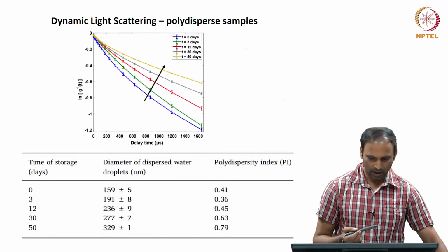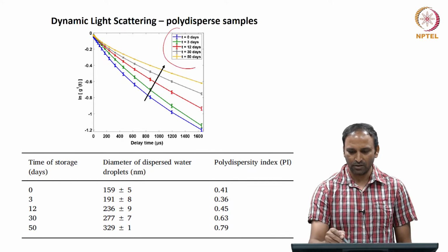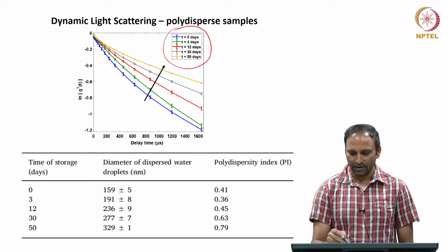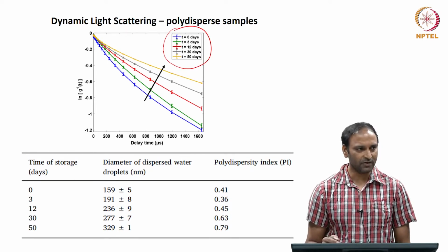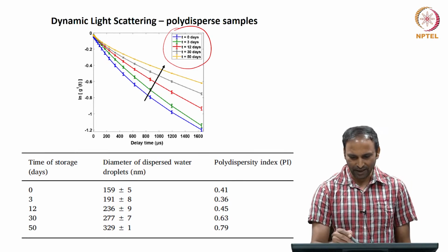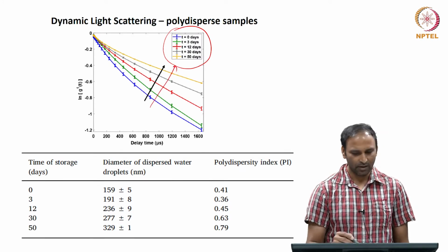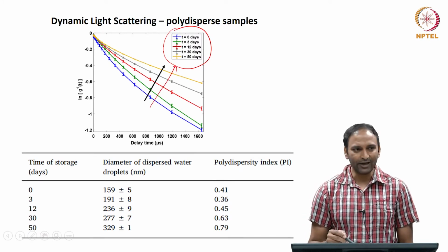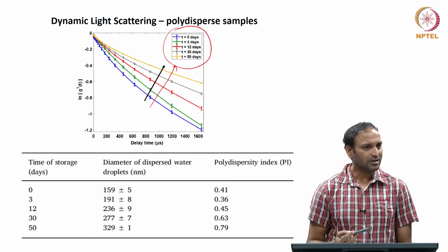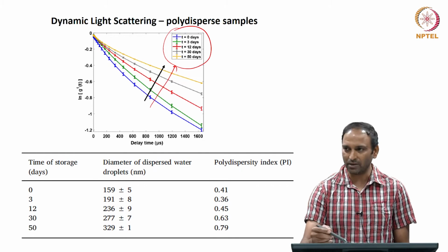These are again some experiments where we were trying to measure size as a function of time for a different kind of emulsion. This variation already tells you that there is something changing. There is a change in the size as you wait for many days.